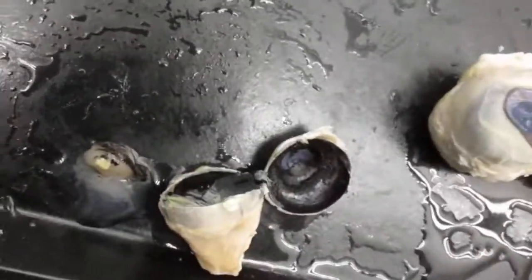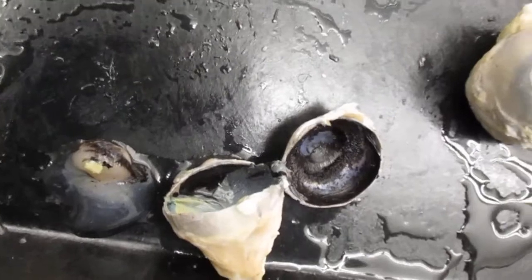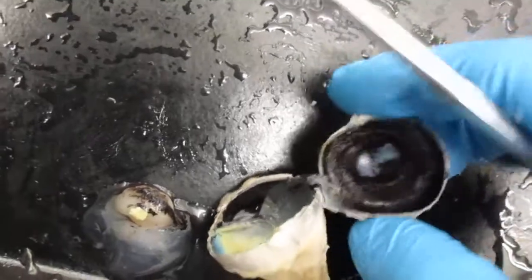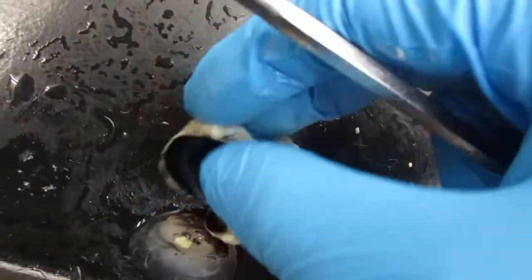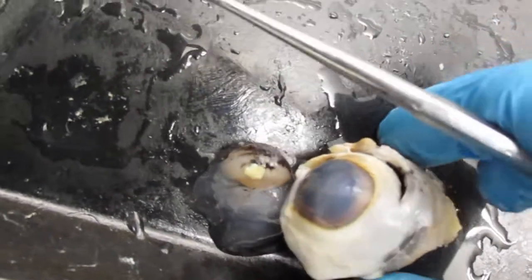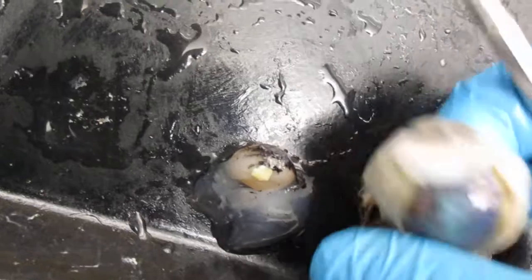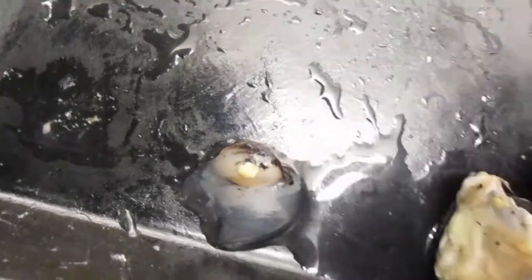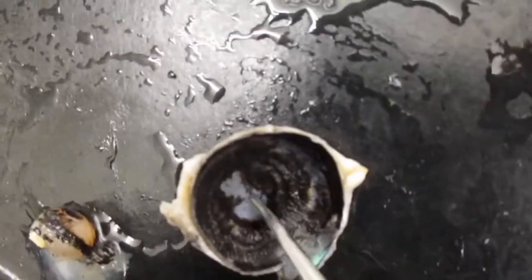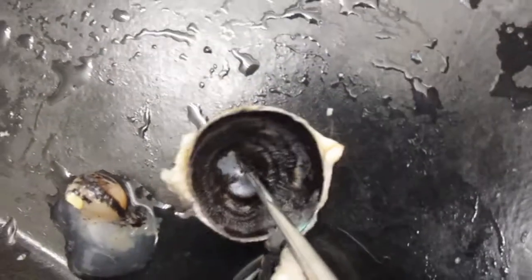Now, if you look right here, I've cut the eye open, and if I can move this around here and put it back to where it was, you can see that. Okay? Now, this is your sclera. And if you look right here, this right here would be the pupil.